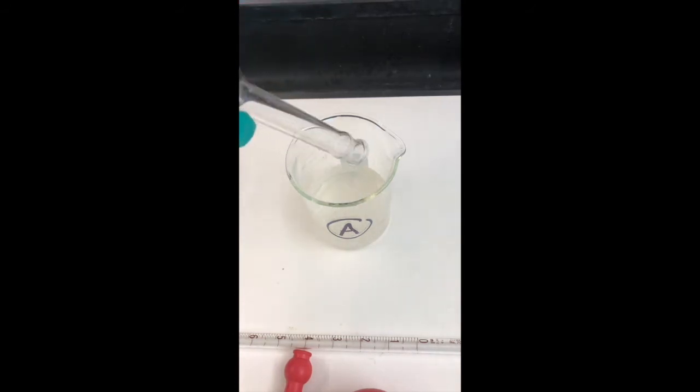All right, we'll now move on to the preparation of our dilutions for the density rainbow. We're going to take the 250 milliliter beaker that we dissolved our sugar in, and we're going to label that A. This is going to be our stock for preparing the 4 other dilutions. We're going to transfer the solution from the volumetric flask that we prepared. This is, again, our stock solution of sugar.